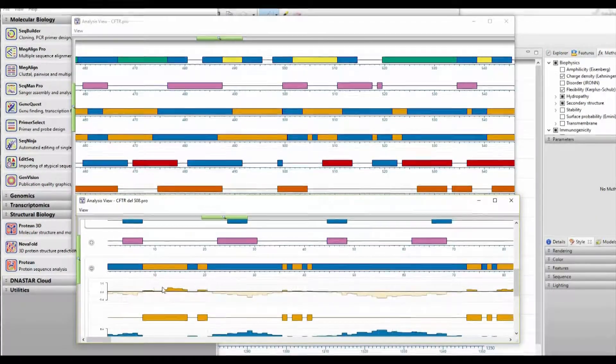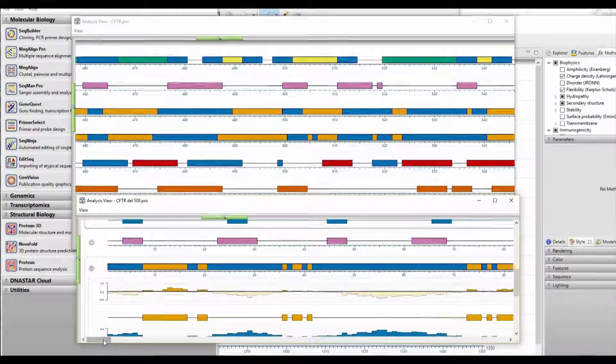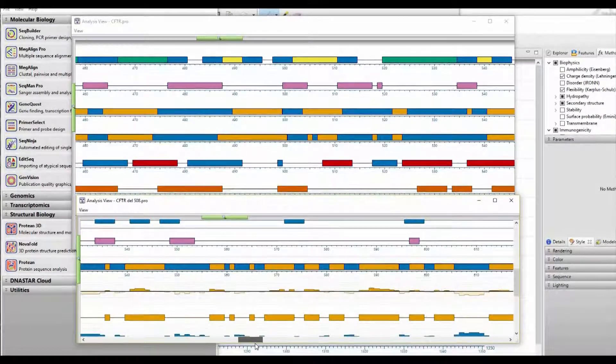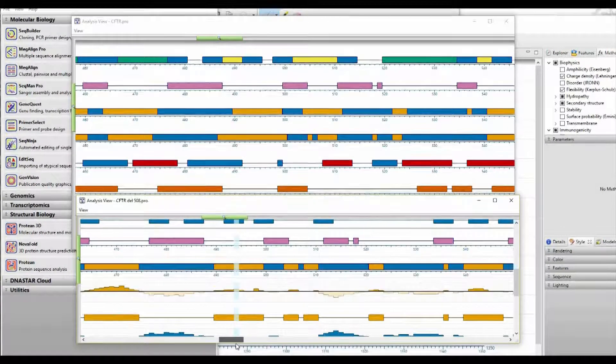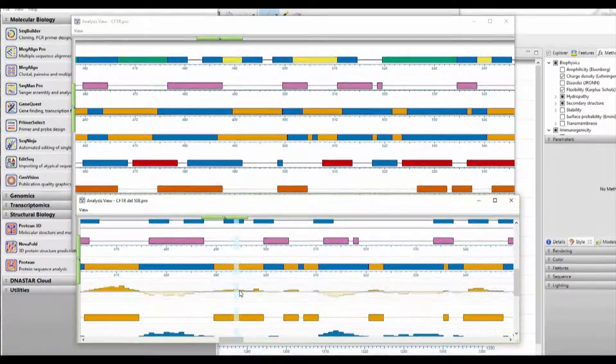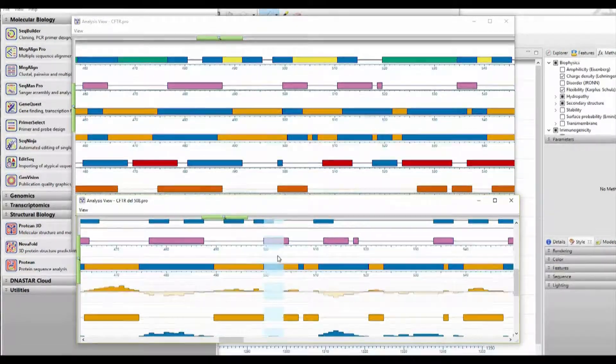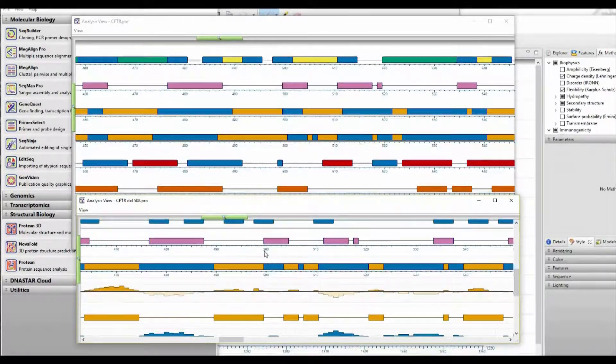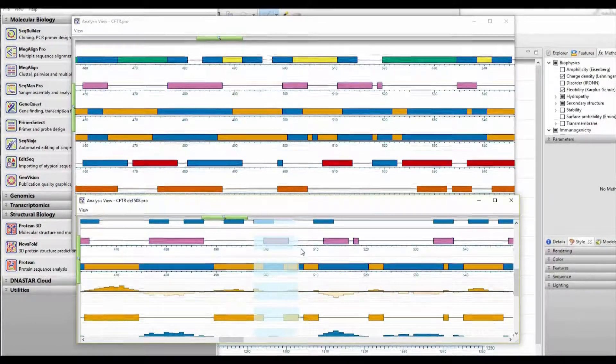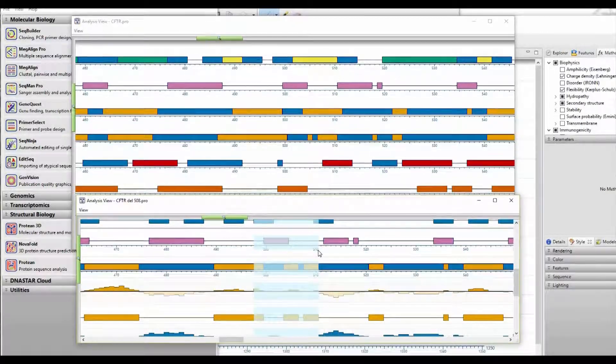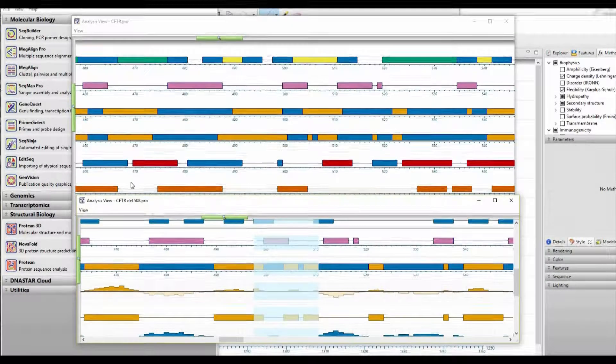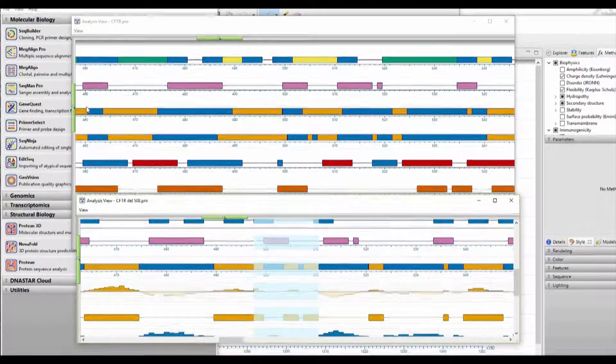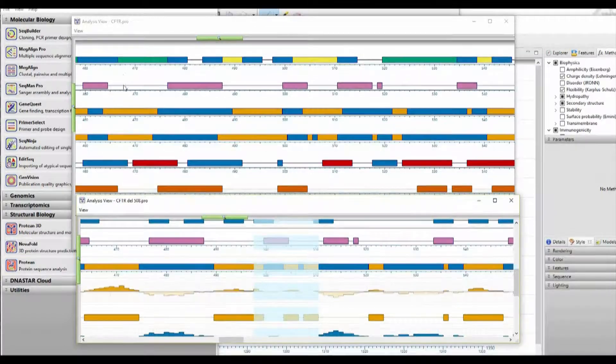...then we're going to expand the views for the different algorithms for secondary structure analysis. We'll focus in this example on hydrophobicity. So I've expanded that view. And now I'm scrolling back over to the region of interest between 500 and 510. So you can see the hydrophobicity analysis for the variant protein sequence.